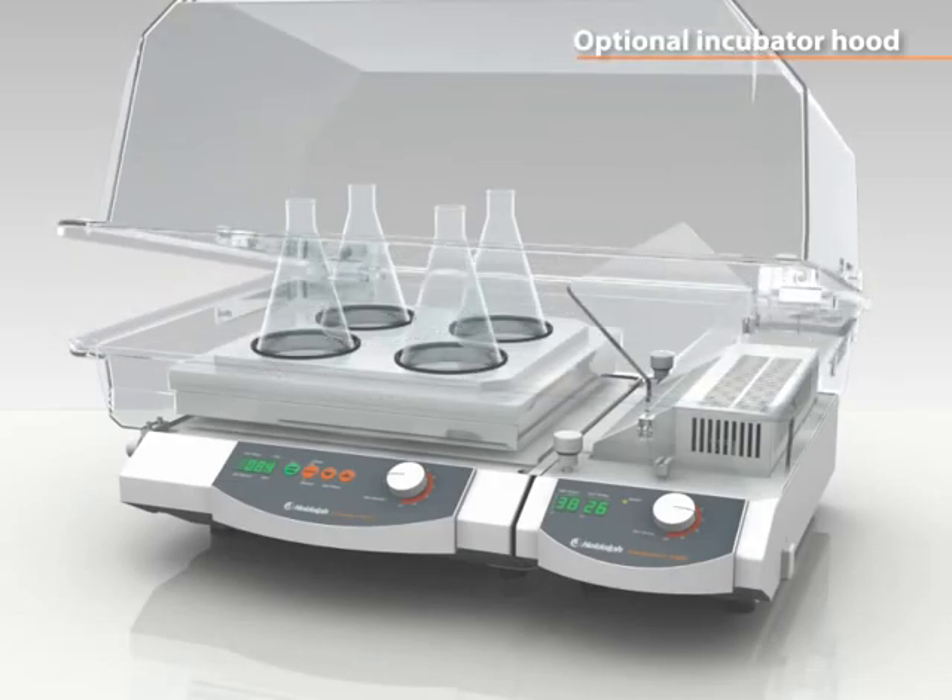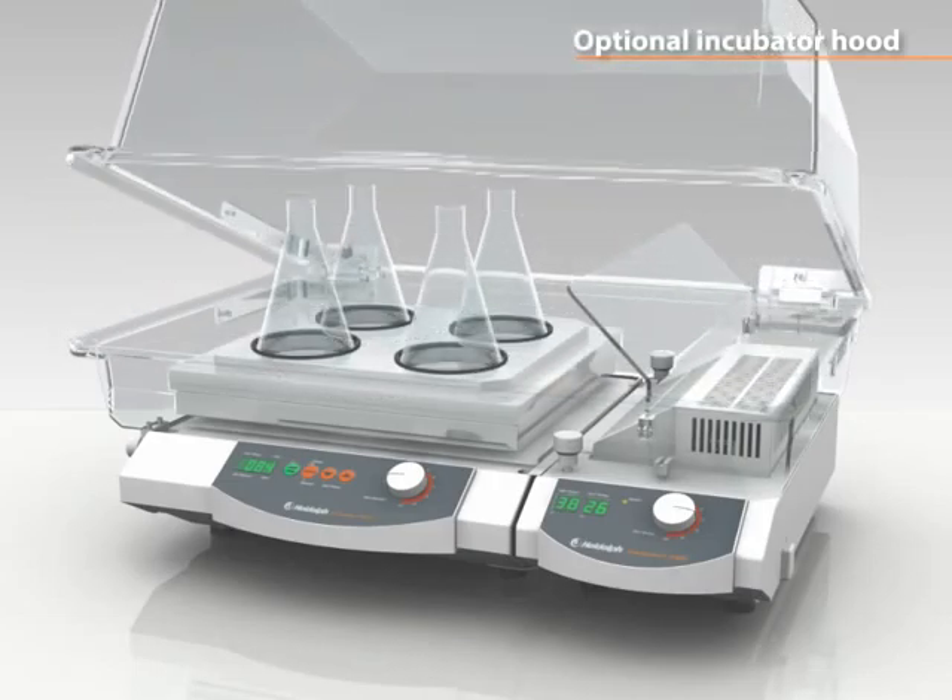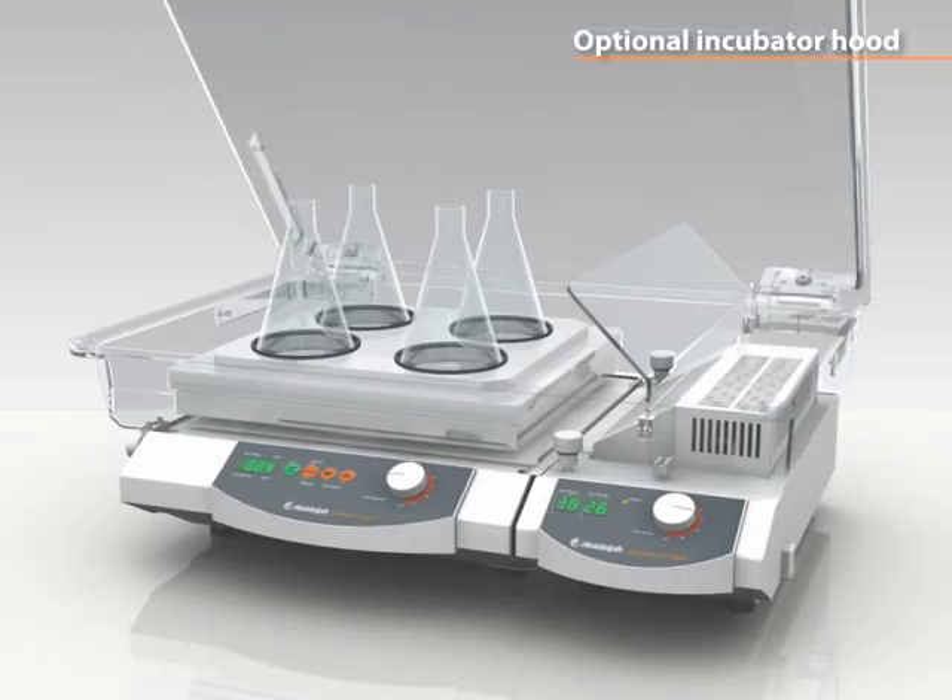An optional incubator hood opens instantly and interlocks in any position, allowing immediate access.